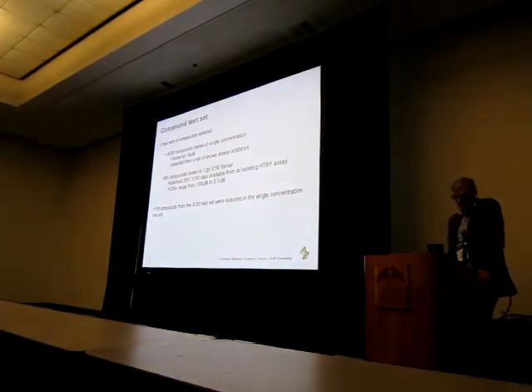We also selected about 400 compounds that had been through the HTRF assay with a range of IC50 potencies, and we wanted to test these again in the FLT so we could do a side-by-side comparison.